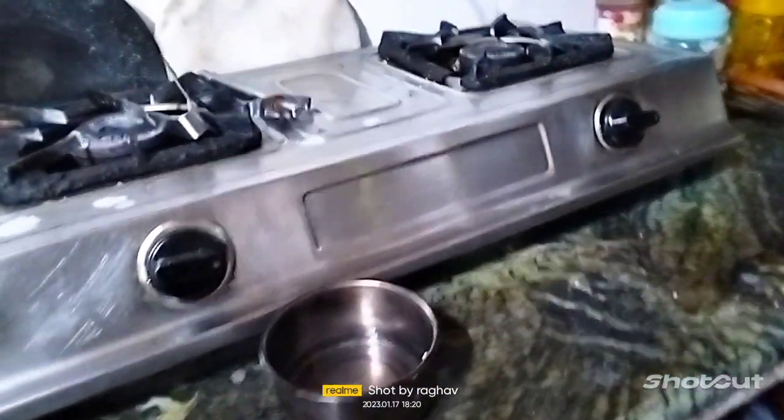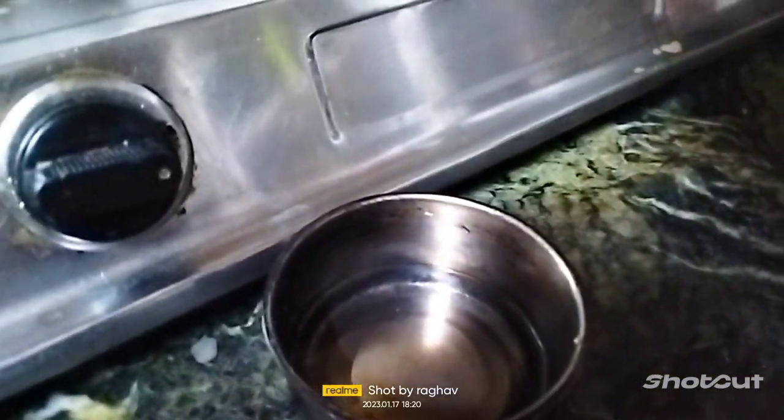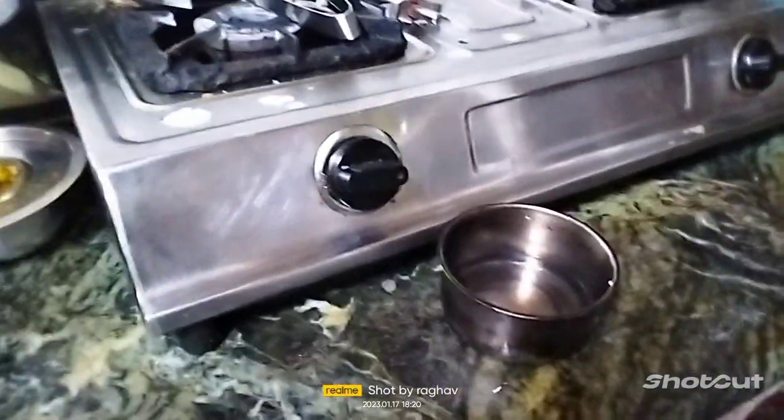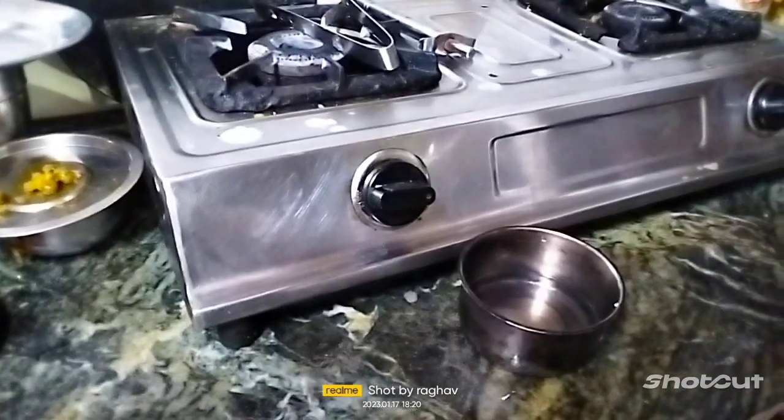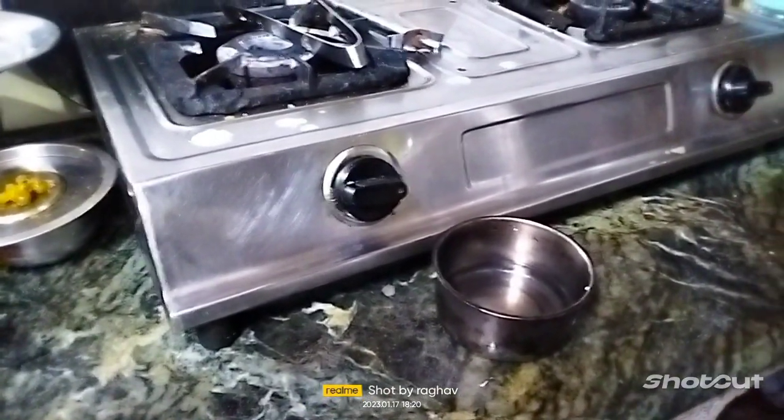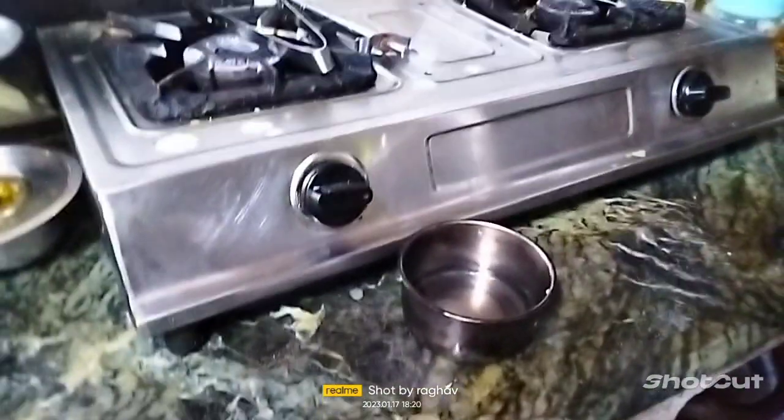Here I am telecasting the channel. This is acetic acid, CH3COOH, and this is glucose, Fruitolite, orange flavor.